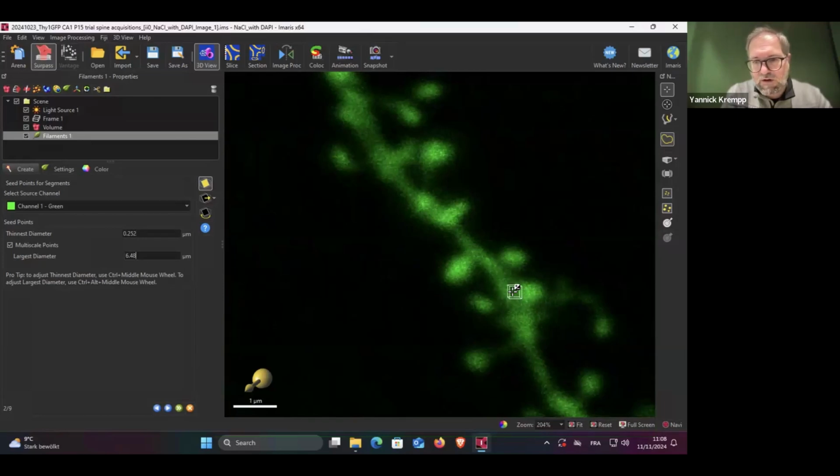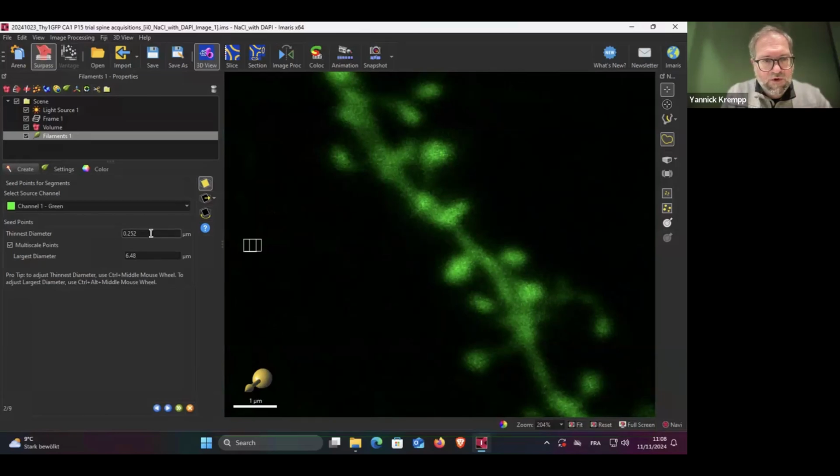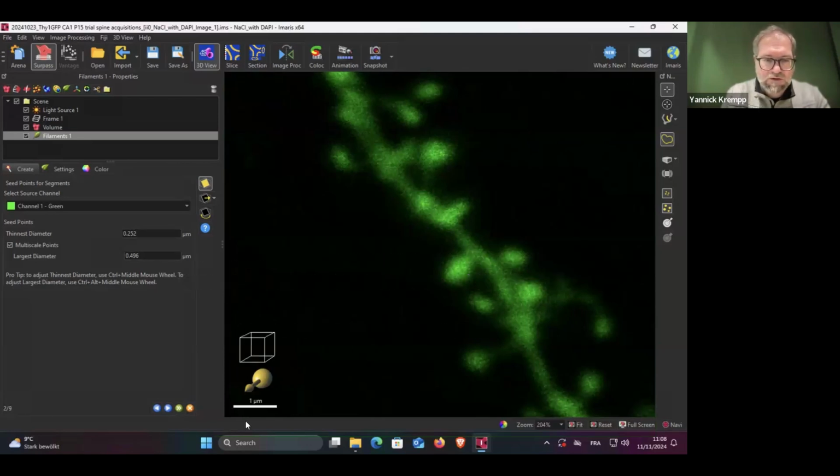If I click here, maybe, yeah. Oh, come on, it didn't change here. 0.25, yeah. This one, it's control plus, so control and option on the Mac, yeah. Okay, so something, yeah, like this, 0.5. So let's use this as a starting point. We will see if we need to update this or not.